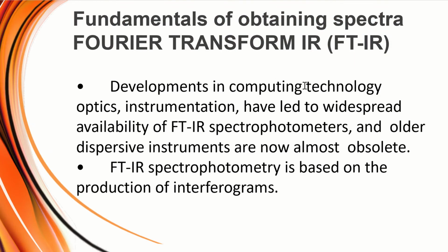However, developments in computing technology, optics, and instrumentation have led to widespread availability of FTIR, that is Fourier transform IR spectrophotometers, and the dispersive instruments are now almost obsolete, and perhaps at this point they are. FTIR spectrophotometry is based on the production of interferograms, right?